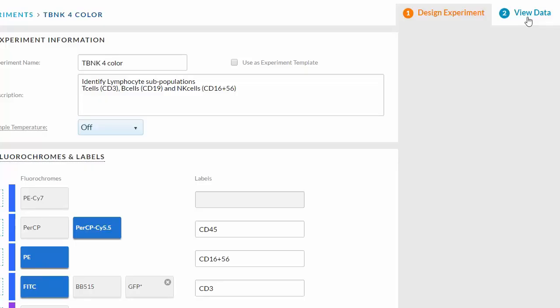After you have designed an experiment, click the second tab, View Data, in the experiment workflow.